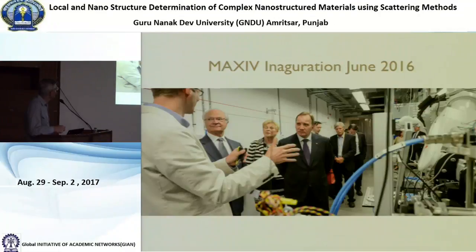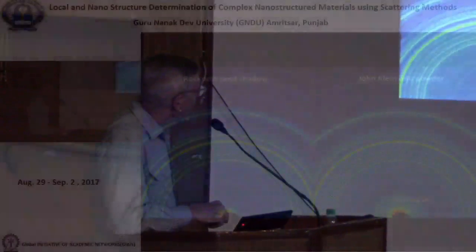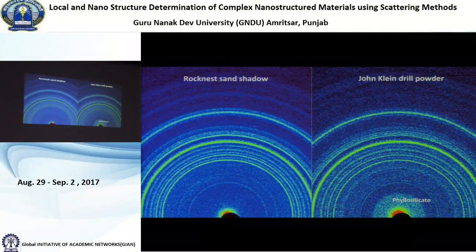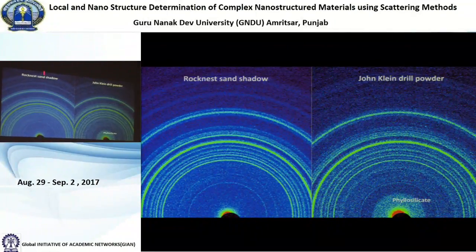And actually, you have to go all the way back. But what the data looked like on the detector is this. So when we have a 2D detector, the data look like this. What's happening is that as a function of position on the detector, that's actually the same as 2 theta in a powder pattern. And so if I just took a cut all the way up here, there would be no peak, and then a small peak, and then an even smaller peak, and then a bigger peak, and a small peak, big peak. So if I took a cut through here, I would get what would look like a 1D powder pattern.